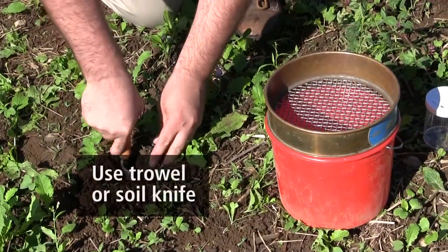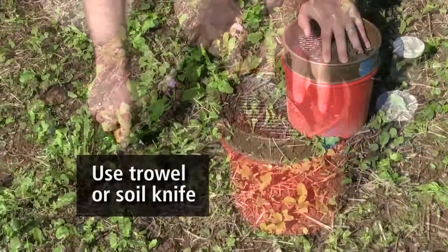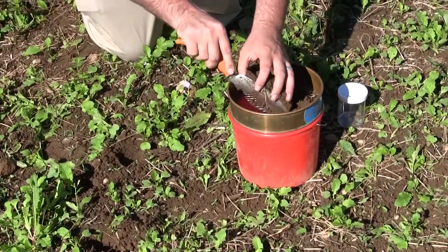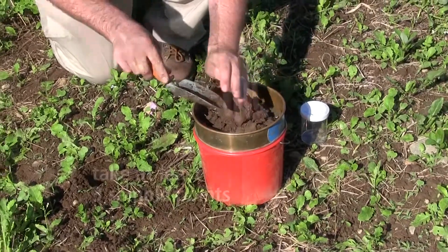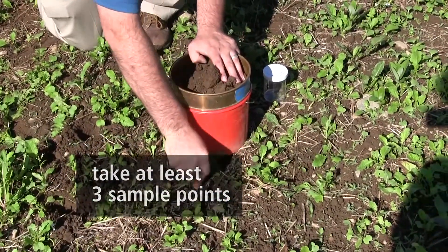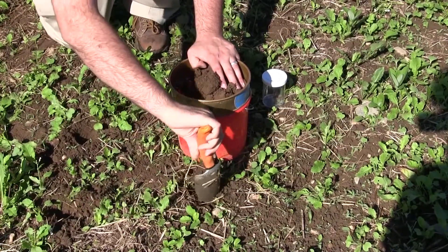Typically you wouldn't want to sample less than two days after a rainfall event. Luckily here in Maine we have very well-drained soils with lots of organic matter, so it's less of an issue here. There's never standing water.